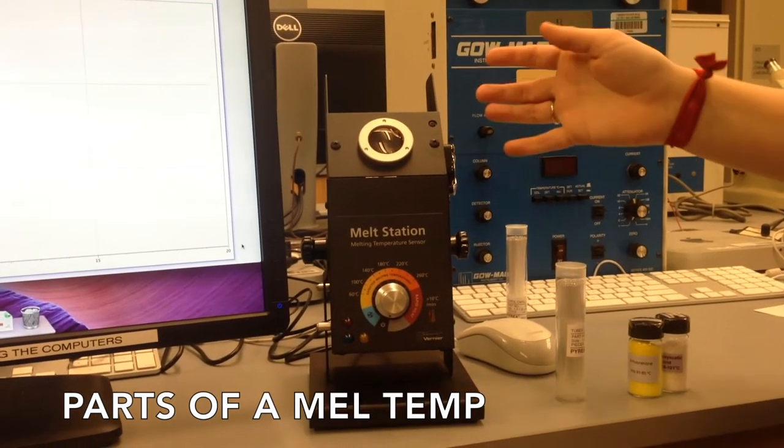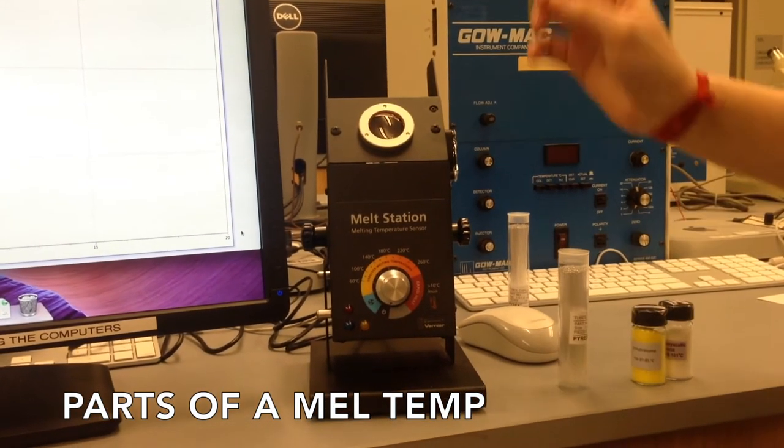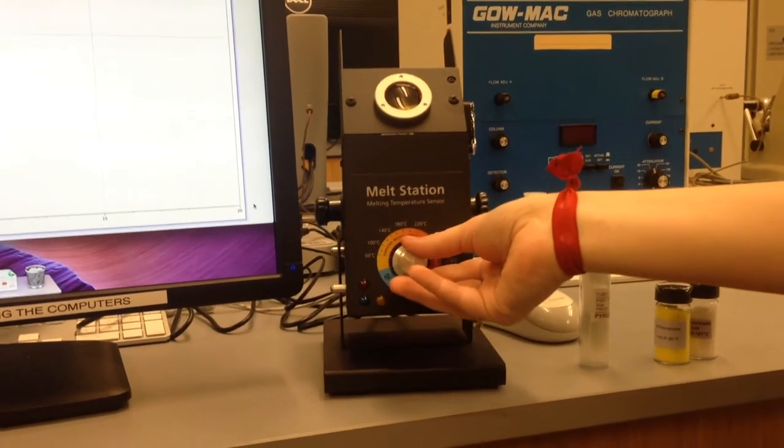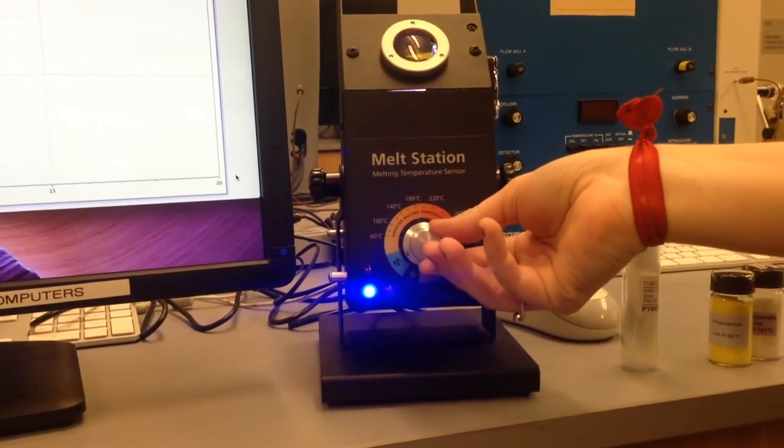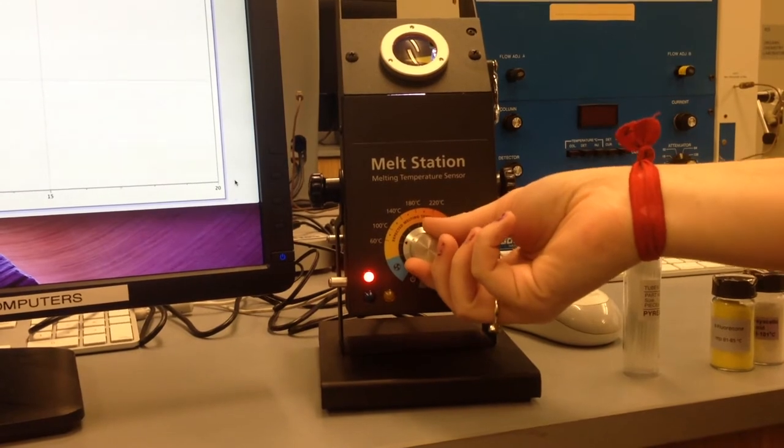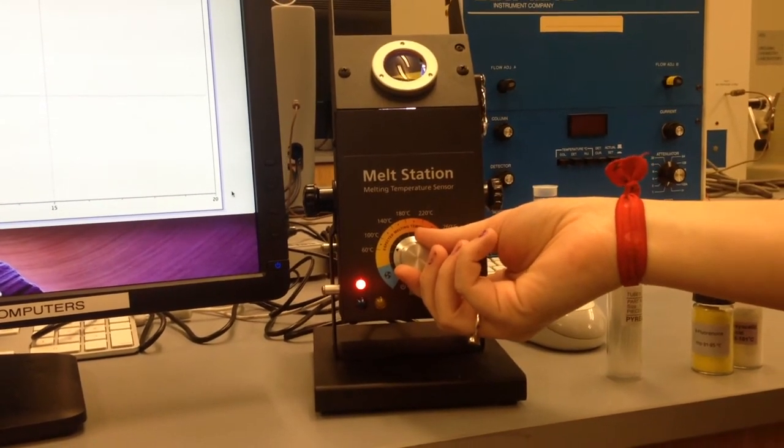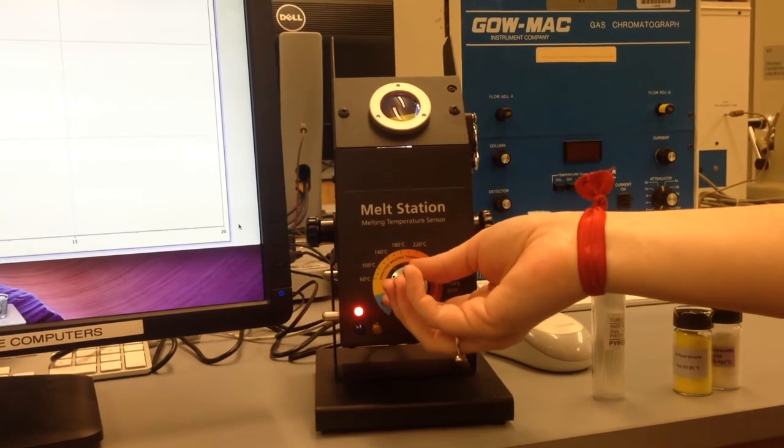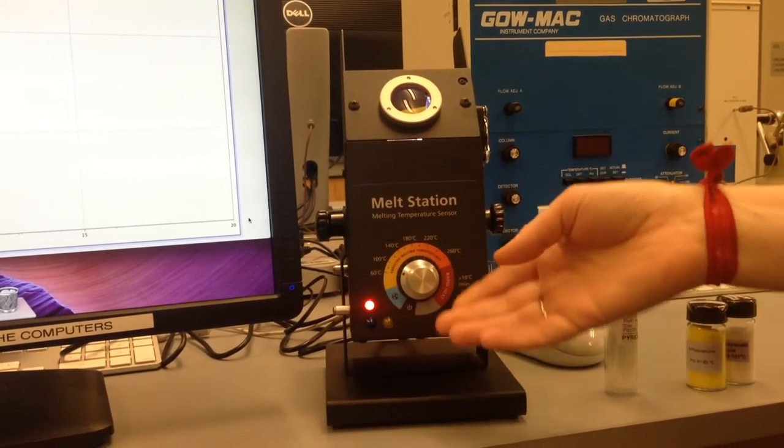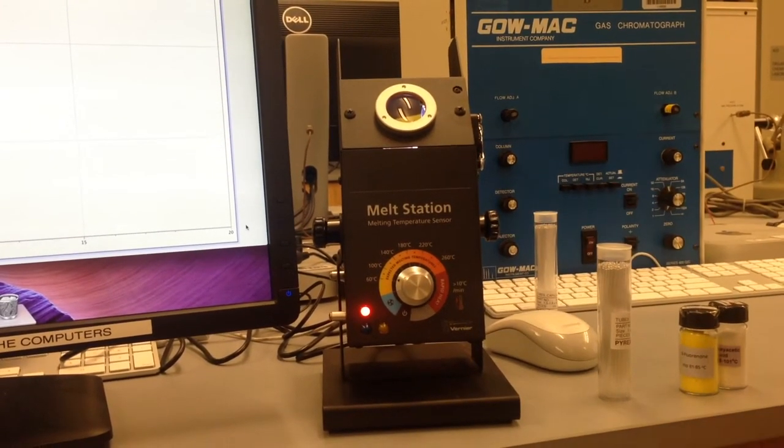Meltemps consist of several parts. Most apparatuses have an on-off switch plus a voltage dial. This one is all-in-one and you just turn on the voltage dial to turn the apparatus on. You can use the dial to adjust how fast the apparatus heats up. If you want it to heat up more than 10 degrees Celsius per minute, you can turn it all the way to rapid heat.